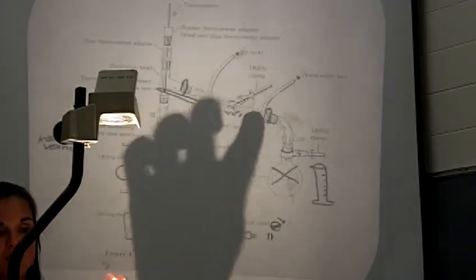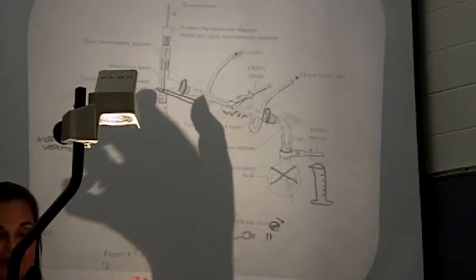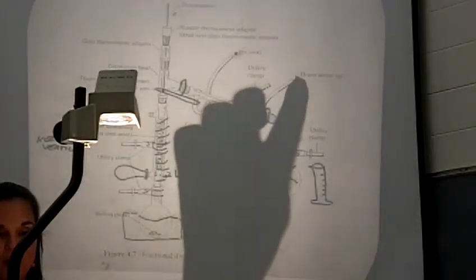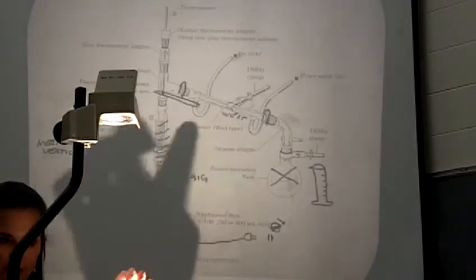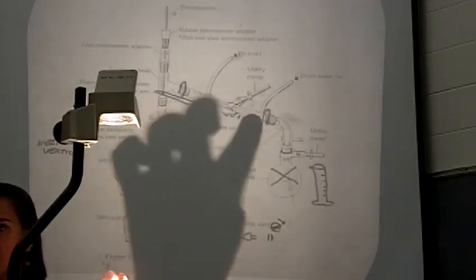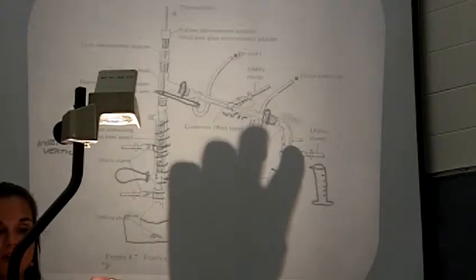Then you're going to come down, you're going to use your West condenser. So your skinny condenser, make sure that's attached tightly, water in always on the bottom, water out on top. So no water here. Water is going to go on the more horizontal condenser, not on the vertical, okay? Then you'll have your vacuum adapter.